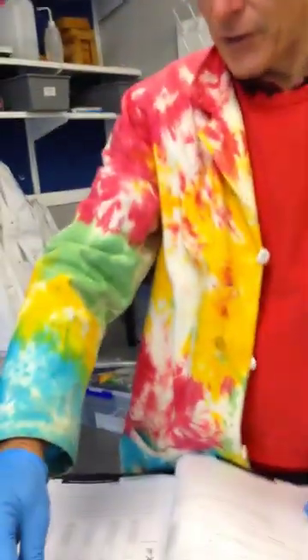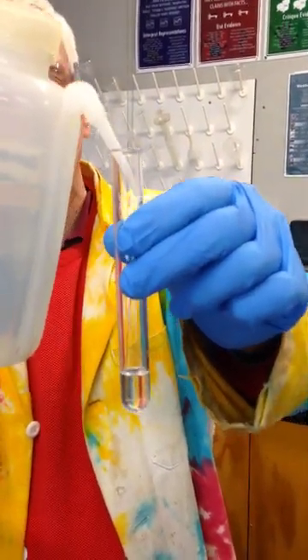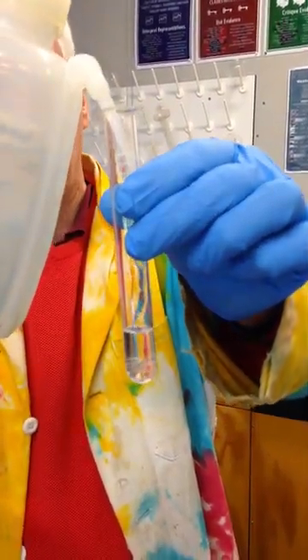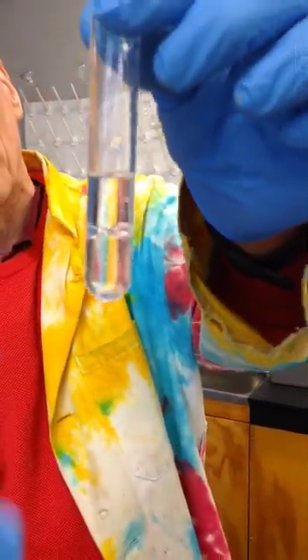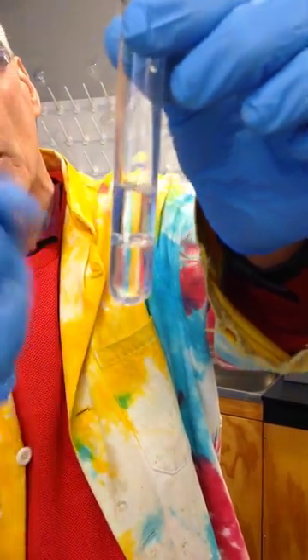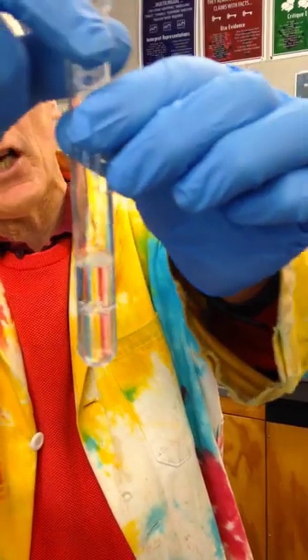And then the final one is turpentine. Turpentine is a hydrocarbon extracted during the oil making process. And you can see again that the water just goes straight down to the bottom. We've got the turpentine on top, the water on the bottom. That means the density of the water is greater than the density of the turpentine. Shake it up, you get that cloudiness, but eventually after time that separates.